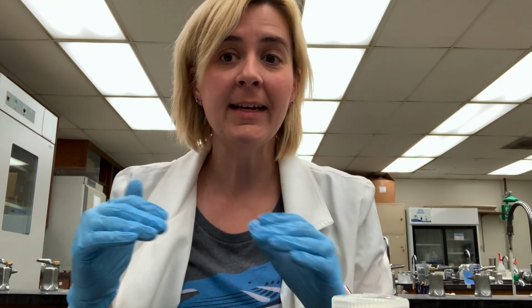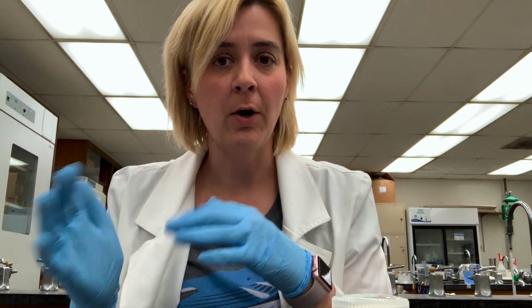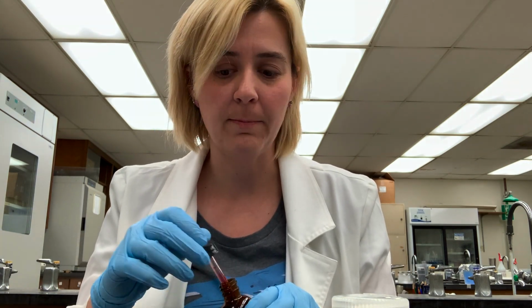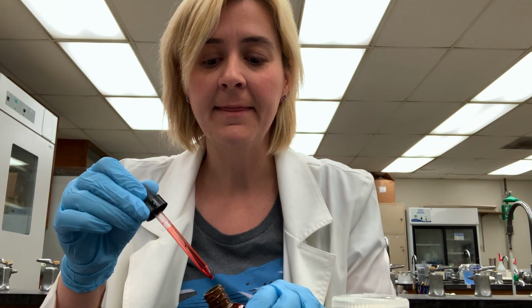And our final step is to do what we call the counterstain. And so in our case, the counterstain is going to be safranin. So what safranin should do is, any cell that still has the crystal violet, so our gram-positive cells, will exclude the safranin. But all of our gram-negative cells, which lost the crystal violet, should take up that safranin, and they'll hopefully turn pink. So I'm going to cover the slide with safranin, and then we'll wait 1 minute and rinse again.